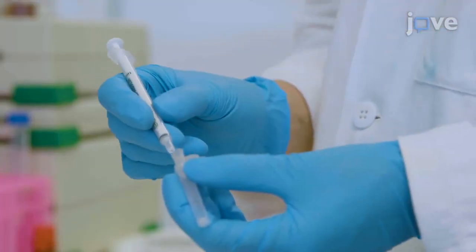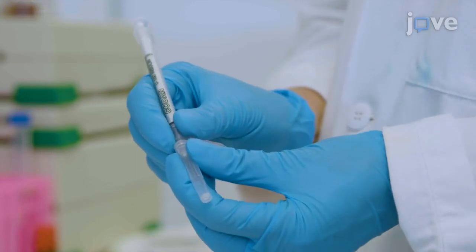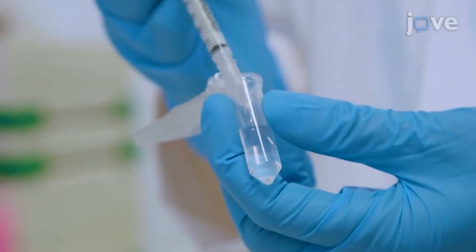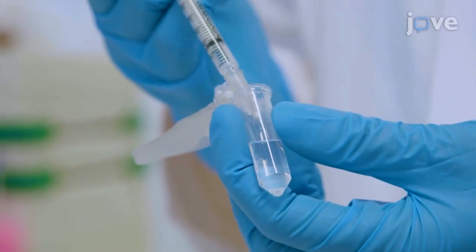To fill an ISCA, attach a 27 gauge needle to a 1 milliliter syringe and load one syringe for each concentration of the filtered chemoattractant.